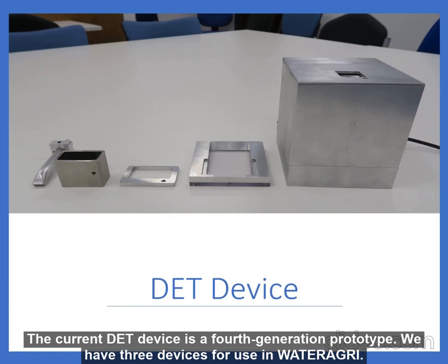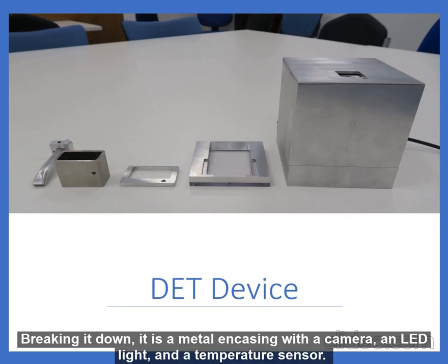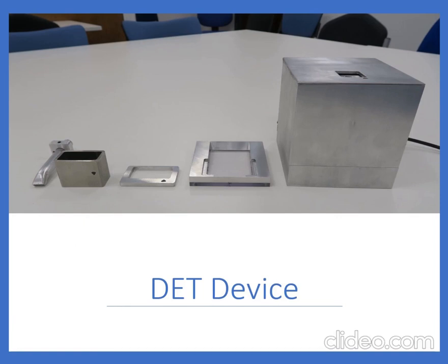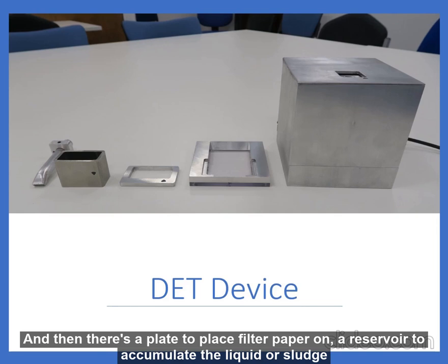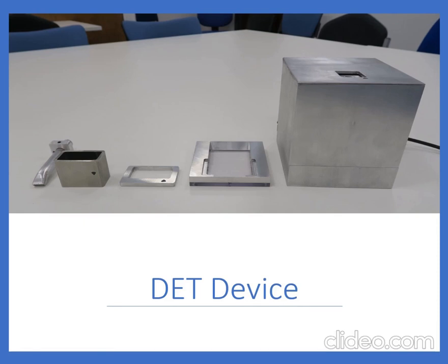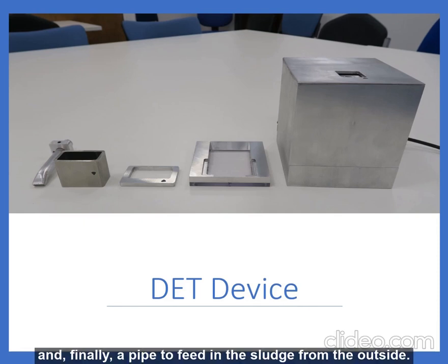The current DET device is a fourth generation prototype. We have three devices for use in Water Agri. Breaking it down, it is a metal encasing with a camera, an LED light, and a temperature sensor. There is also a plate to place a filter paper on, a reservoir to accumulate the liquid or sludge, and finally a pipe to feed in the sludge from the outside.